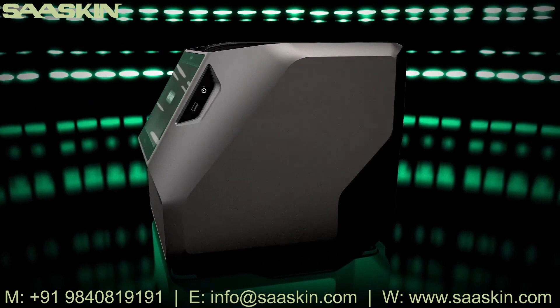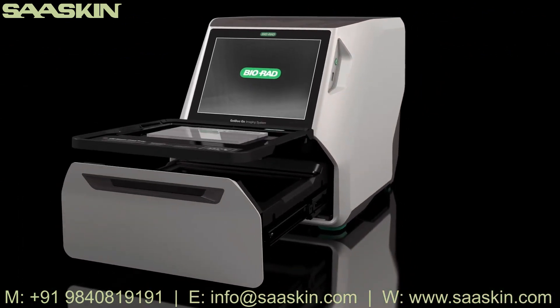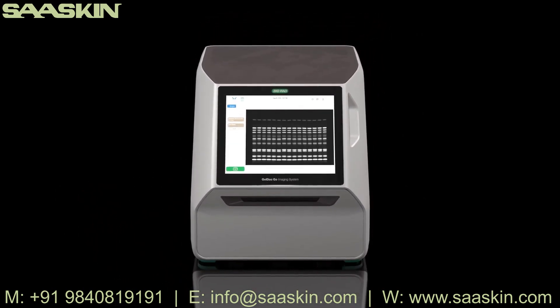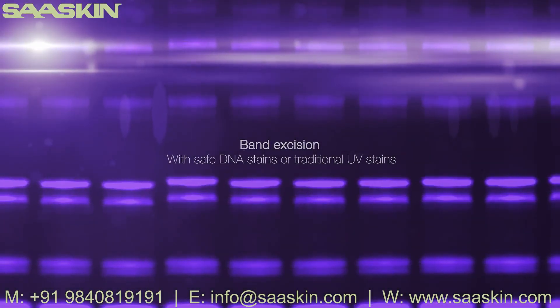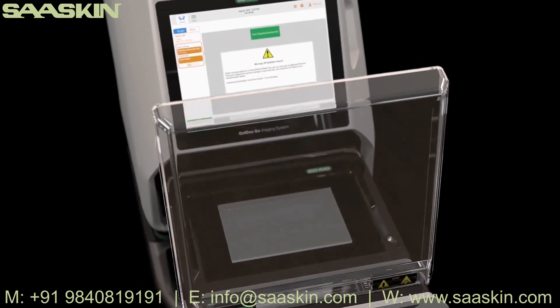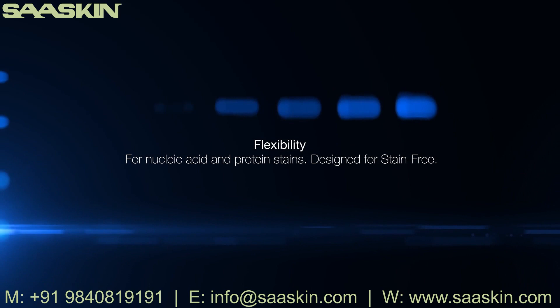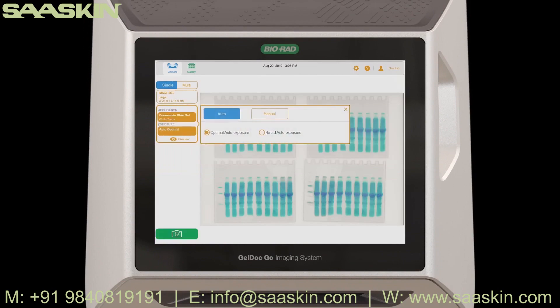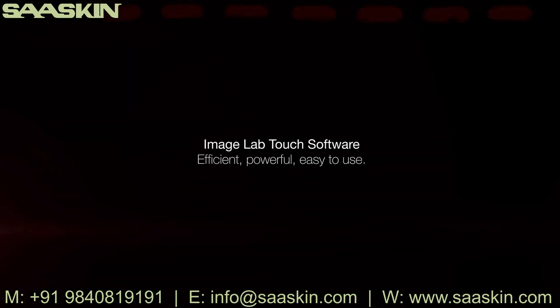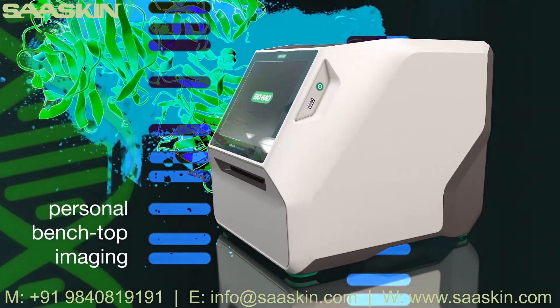We have now designed the most powerful yet compact gel documentation system. This advanced gel documentation system gives you the flexibility and performance you need in a small and easy-to-use package. Perform nucleic acid gel imaging and band excision with traditional UV stains or using safe stains with the optional blue tray. Image protein gels with your favorite protein stains or with Bio-Rad stain-free technology. Manage user accounts, acquire images, and export data with Image Lab Touch software. Flexibility, power, efficiency — the new easy-to-use GelDoc Go.